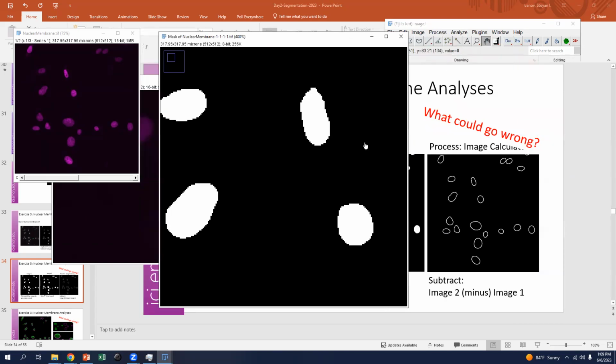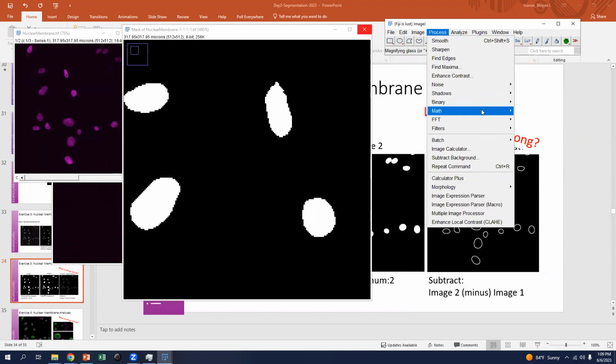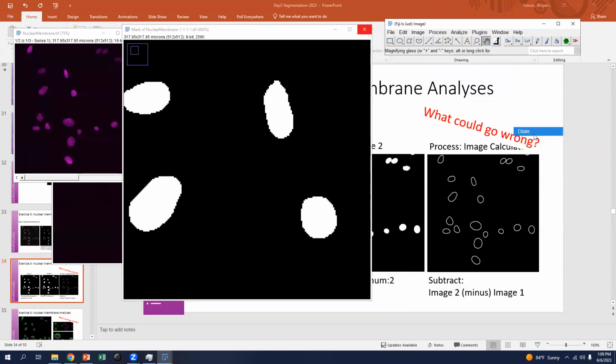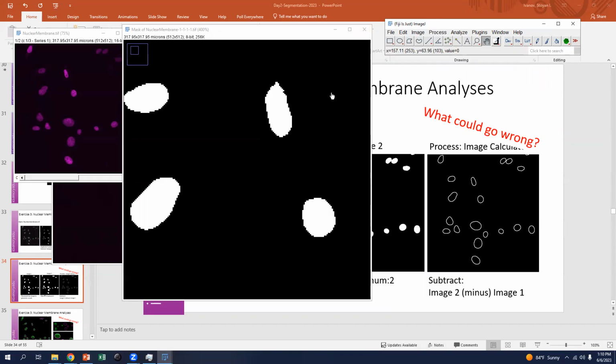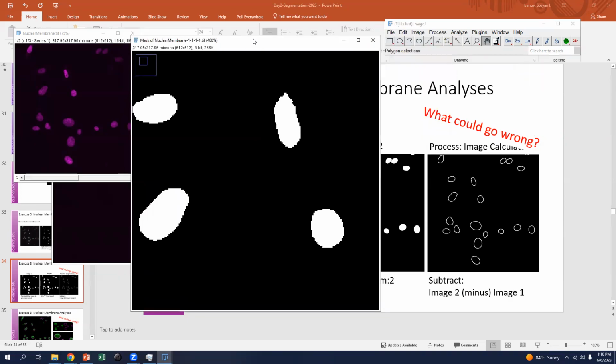Okay, there we are. So, back to 1. And if we use it, we see they all grow by 1 pixel. Similarly, it wasn't dilate, it was erode. Then they'll get even smaller. But this is for the outermost structure of the cell.